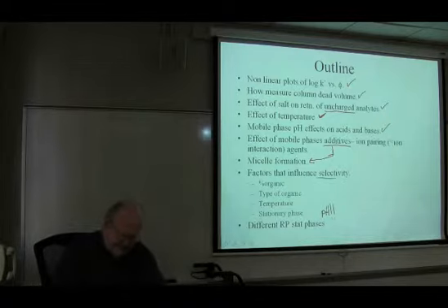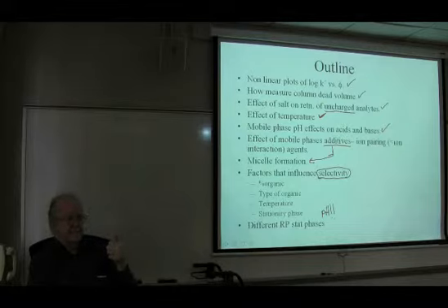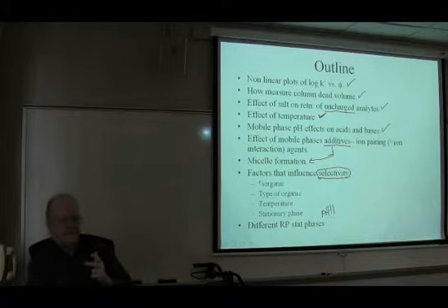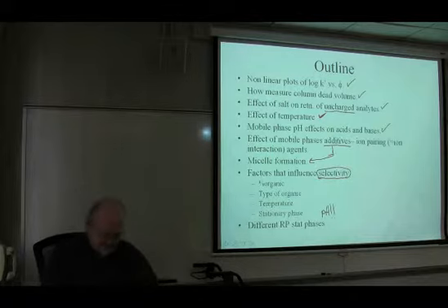So the factors that influence your retention and selectivity in reverse phase chromatography are, number one, the percent organic. The amount of organic can change relative retention. The type of organic can change relative retention. The temperature can have a small but sometimes very dramatic effect on retention and especially selectivity. For compounds that are very close together, temperature sometimes can kick them apart just enough to make the separation a lot easier or a lot more difficult.